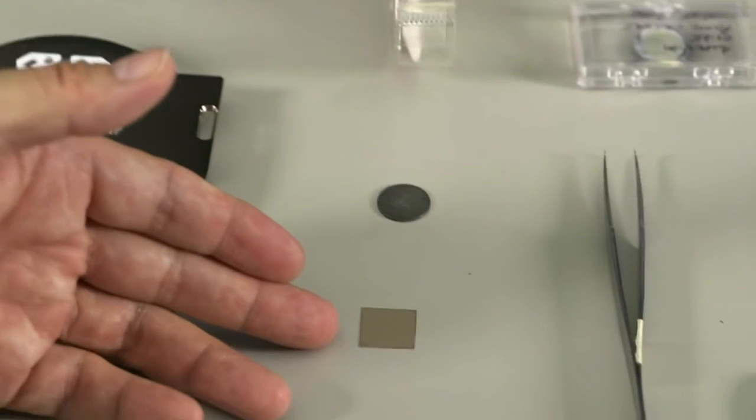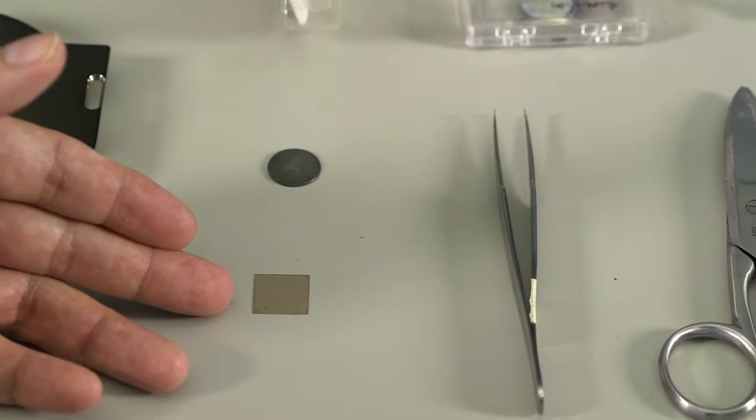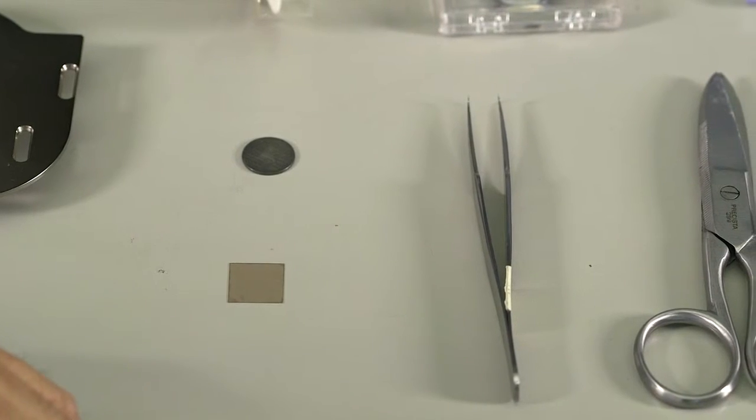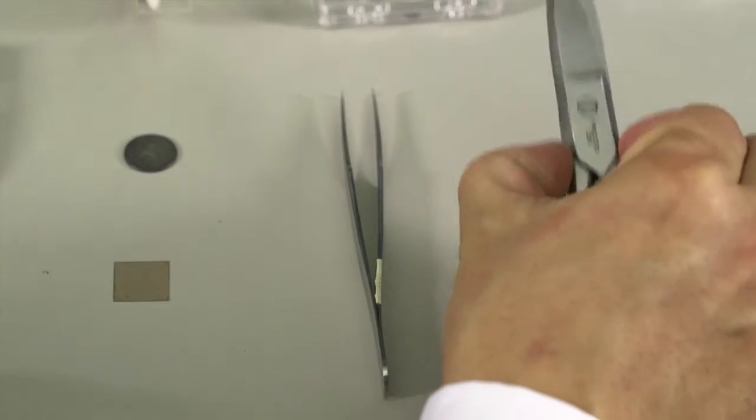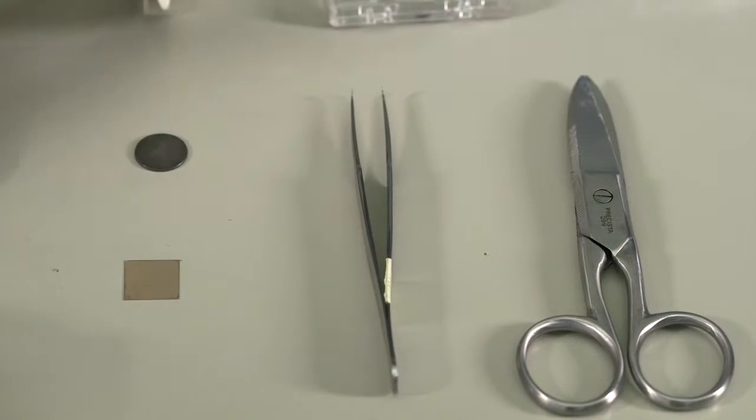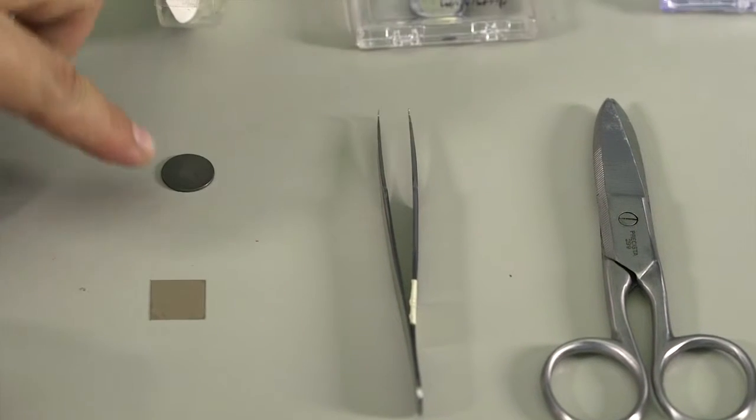This piece of mica is going to be the sample today. We're also going to need a tool, such as a pair of tweezers, a pair of scissors, and we also need double-sided tape and a steel sample dish.